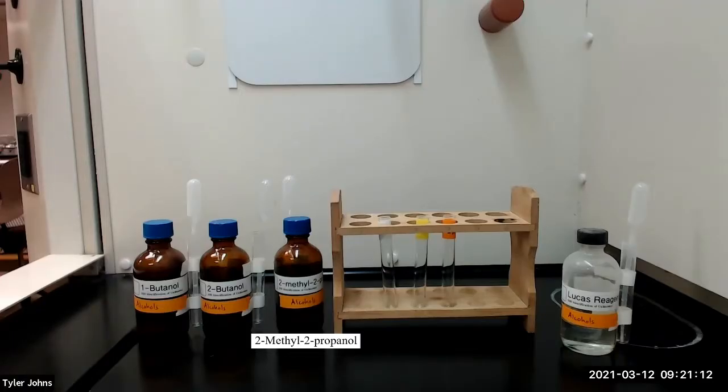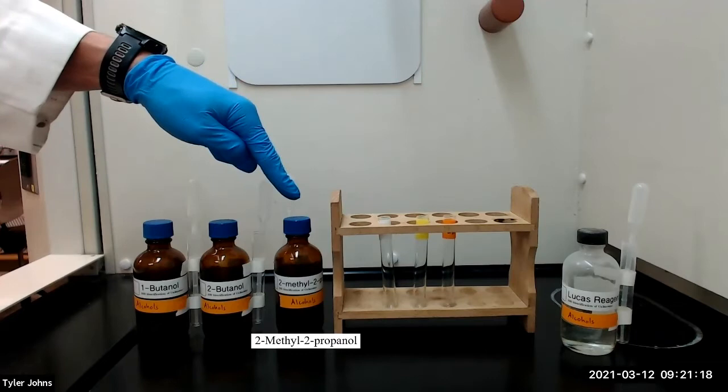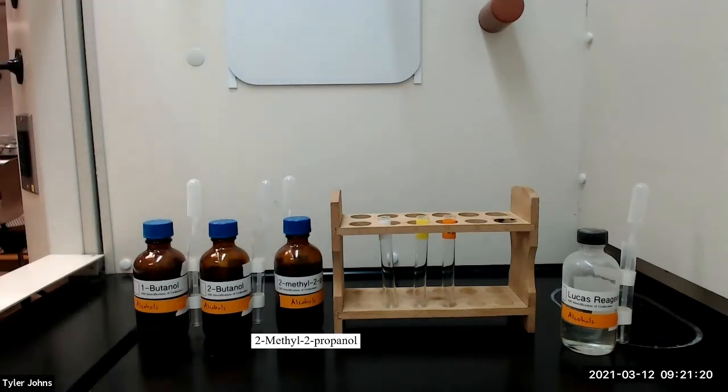We will now perform the Lucas test for alcohols using the test compounds 1-butanol, 2-butanol, and 2-methyl-2-propanol. This test depends on the appearance of an alkyl chloride as an insoluble second layer when an alcohol is treated with the Lucas reagent, which is a mixture of hydrochloric acid and zinc chloride.